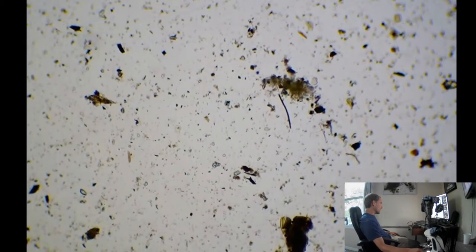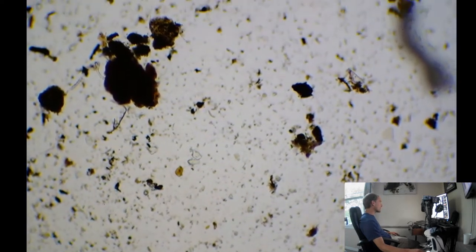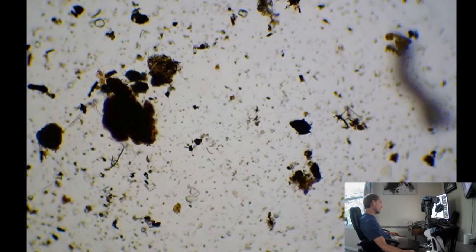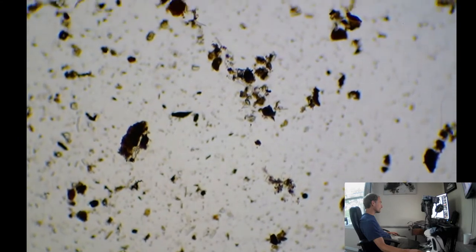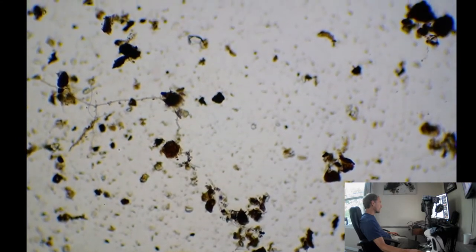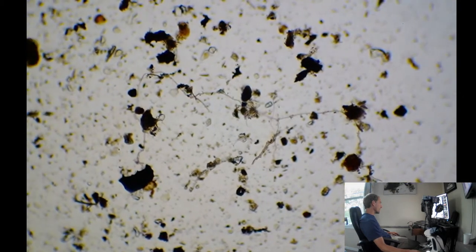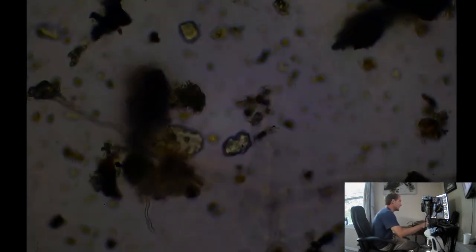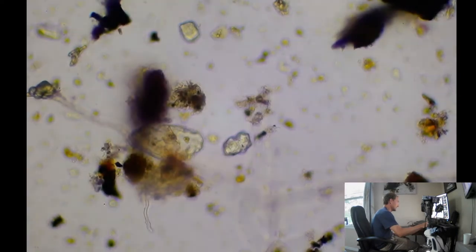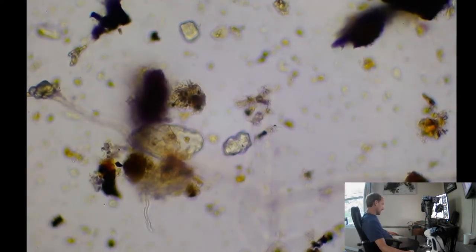Alright. Let's find some creatures. Got all sorts of fungal hyphae here. That's looking nice. Alright, we gotta look at the good fungi up close. Whoa. Almost knocked into the slide, but looks like we actually just missed it. We're still in the same spot. Alright, let's look at this.